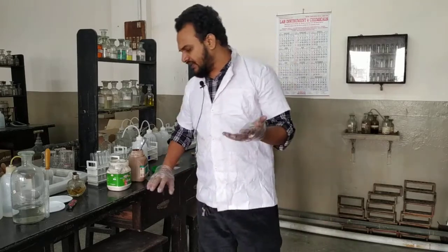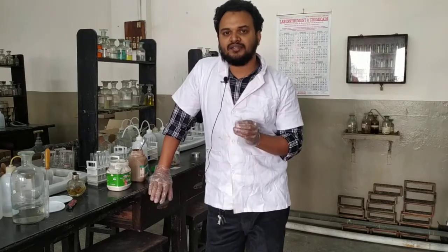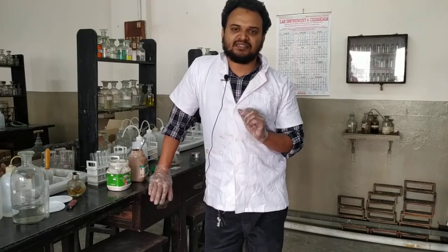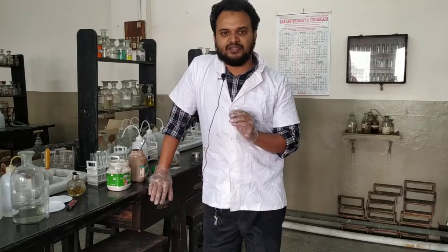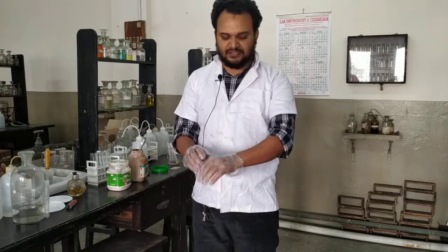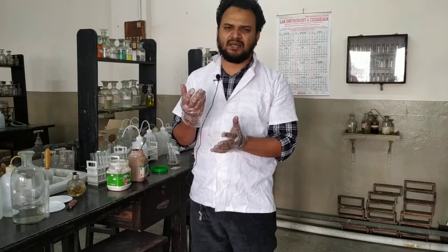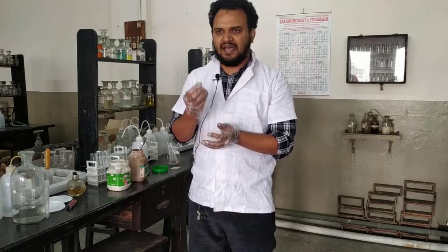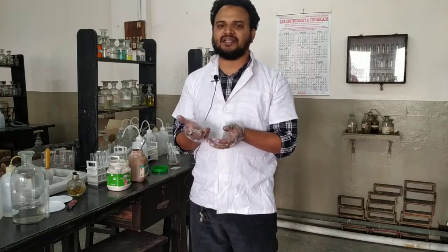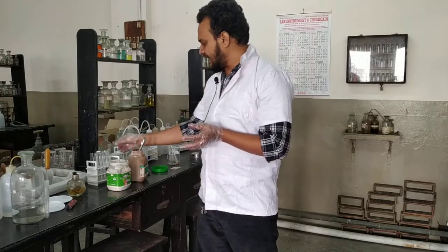And in the tests of formaldehyde, I have also said how to prepare Tollen's reagent. However, in your exam, in your laboratory at class 12 level, Tollen's reagent is directly supplied. But it is always better to perform the test with freshly prepared Tollen's reagent. There is no alternative to freshly prepared Tollen's reagent. You just have to take 2 ml of silver nitrate solution, add 2 drops of dilute NaOH, it will give you a dark grey precipitate, and then dissolve it in excess NH4OH. That is simply your Tollen's reagent.